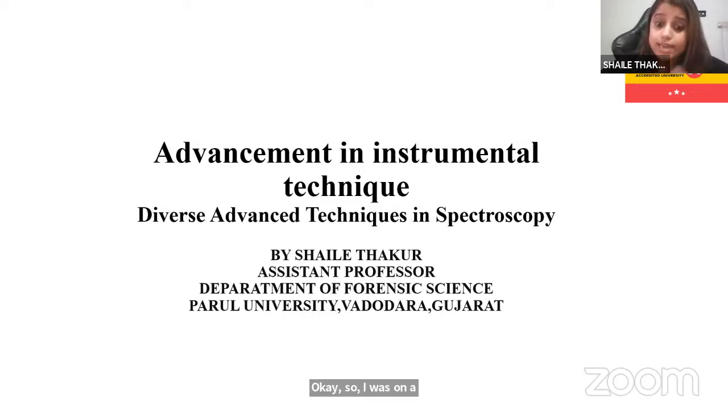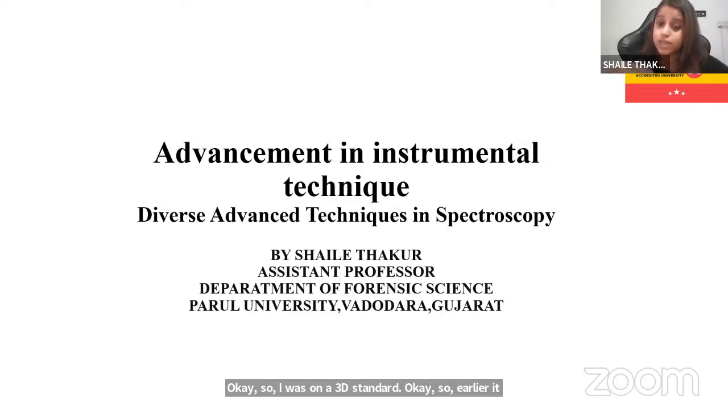Earlier it was very difficult to reconstruct a crime scene, especially in places where evidence was removed or tampered with. But nowadays we have the awesome option of the 3D scanner, which uses different types of light to scan the length, breadth, and height of the trace evidence present in small amounts at the scene of occurrence, and gives you the result and data in 3D form.